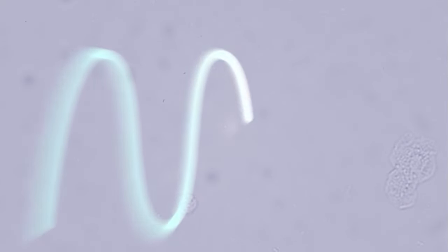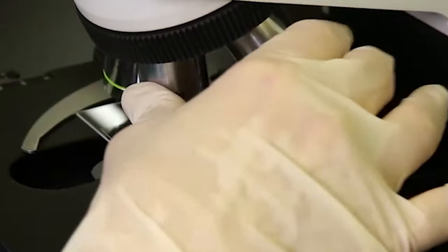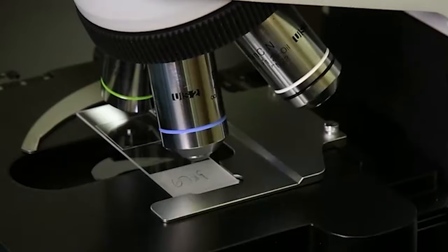As you look at the specimen under the 10x objective, you may notice some movement. Switch to the 40x objective to identify if what you are seeing is Trichomonas.